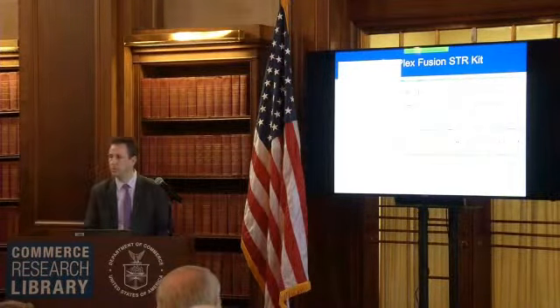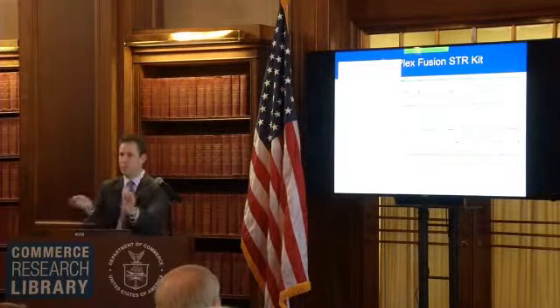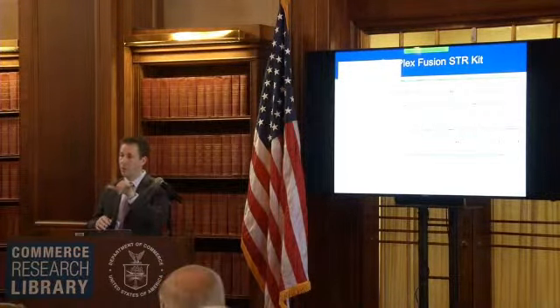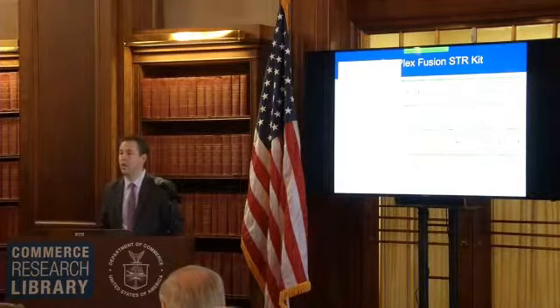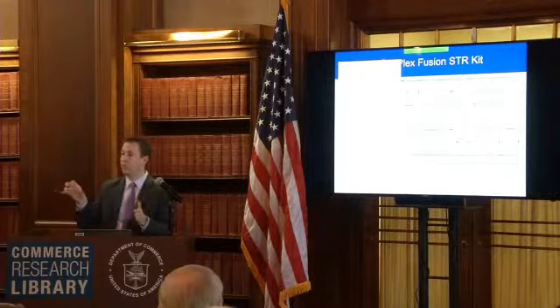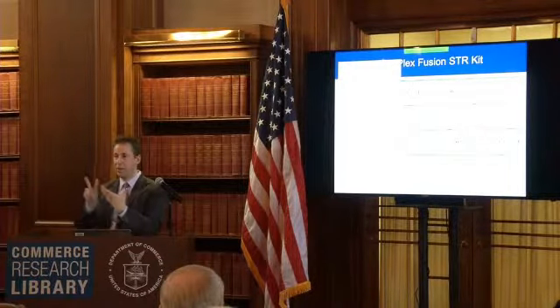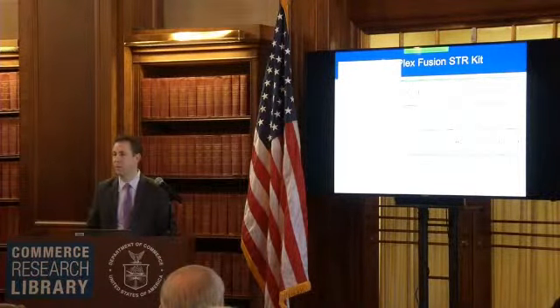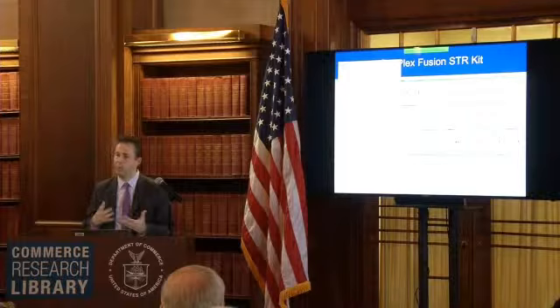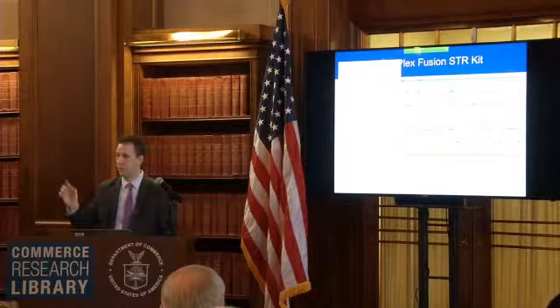Fractional counts? How do you get a fractional repeat? So it's fractional in the sense that most of these are called tetranucleotides, so it's a GATA, or some 4-base repeat. Well, in some cases, you might have a motif that, due to mutation, might go to 3 or it might go to 2. So the 22.2 means there's 22 4-base repeats, and then there's 2 more bases. So one of them got truncated by 2. If it was 22.3, then it'd be 3 bases. So it's called a microvariant, but it's a sort of deviation from the normal tetranucleotide repeat.